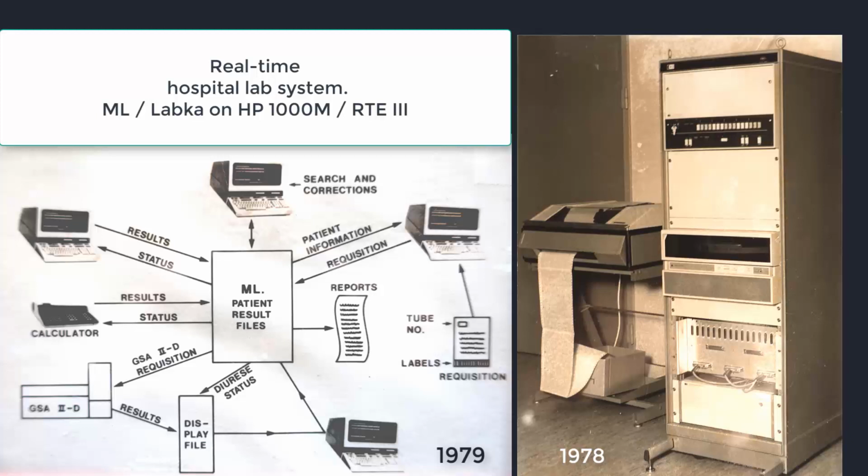The system here worked completely in real time. That is, all functions worked simultaneously with short response time, also during the frequent selected prints to the clinical department. On the right is shown keying in the requisition data.